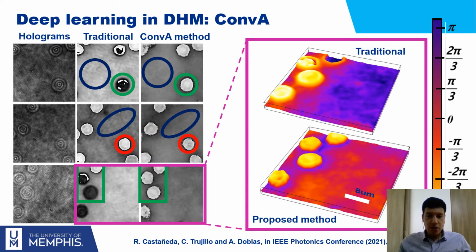In here, we can see some of the results, and we see that although the convolutional method yields images with some high spatial frequency noise in the edges of the specimens, we can see also that the background of the images by the convolutional autoencoder method is essentially homogeneous, which is expected, and we already know that this is the actual background that we need to have.